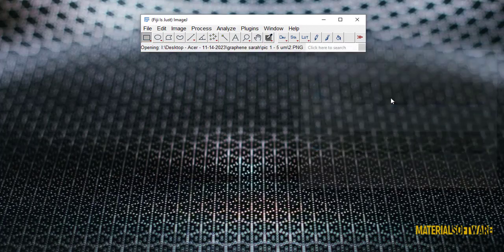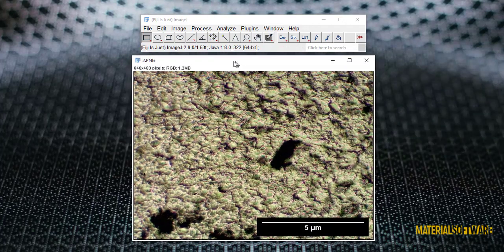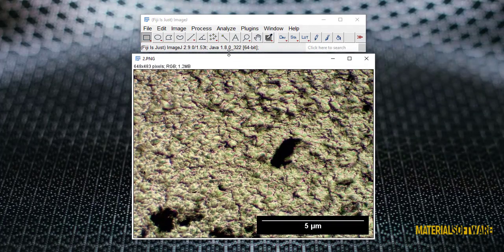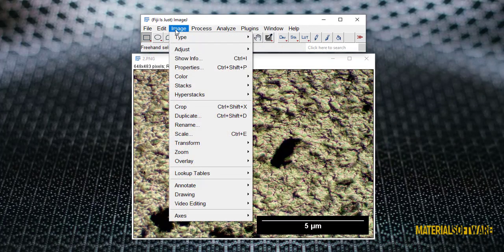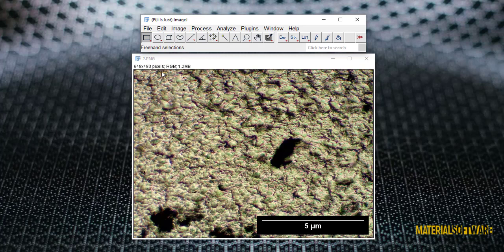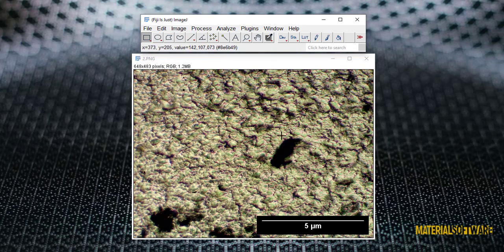First, we enter the desired image into the software. You can see that in this image there are black areas that represent porosity in the structure, and we want to calculate the percentage of these porosity.